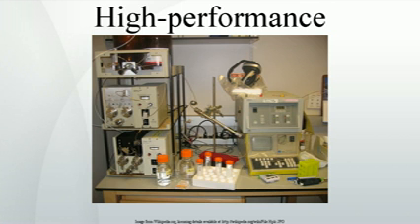HPLC is distinguished from traditional, low-pressure liquid chromatography because operational pressures are significantly higher, 50 to 350 bar, while ordinary liquid chromatography typically relies on the force of gravity to pass the mobile phase through the column.